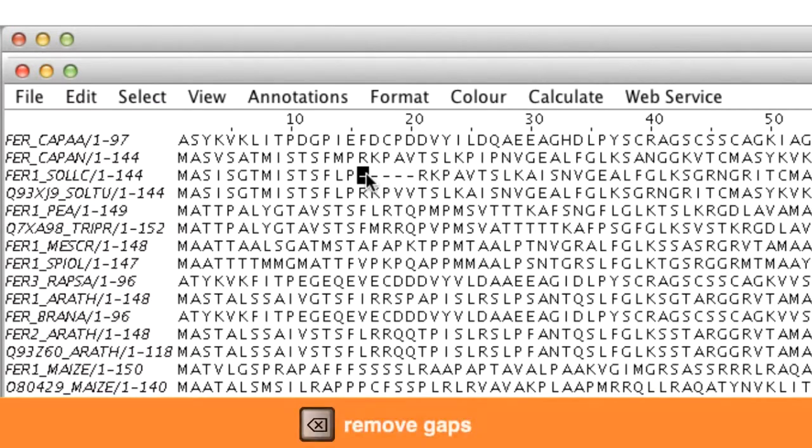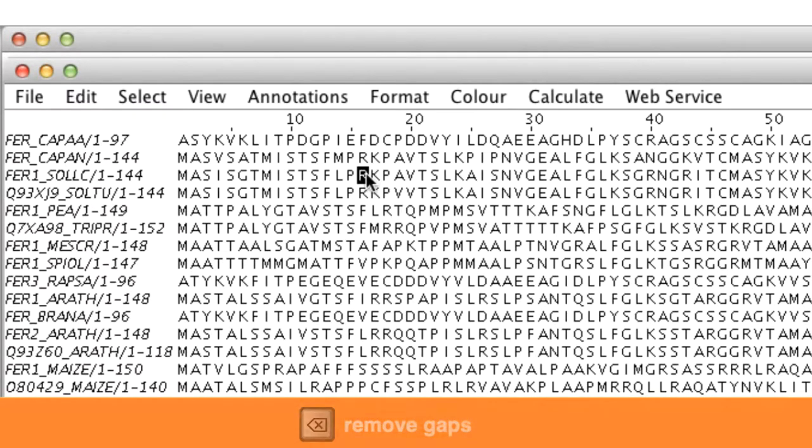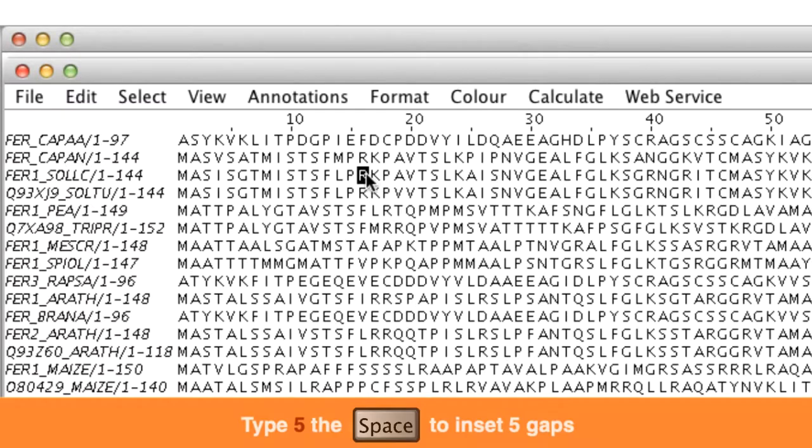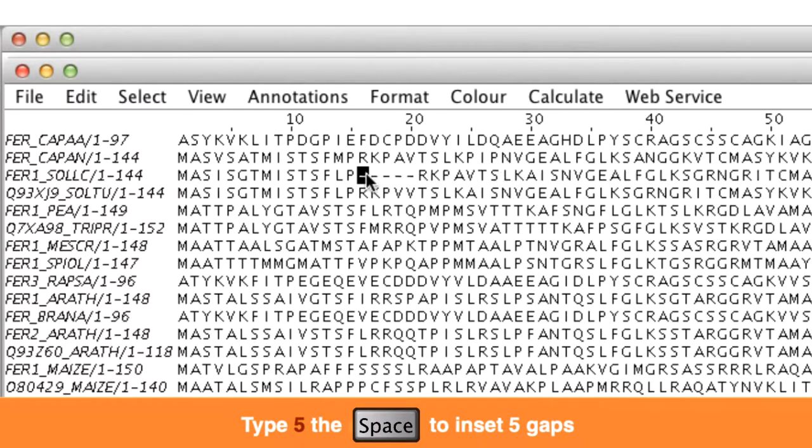Gaps can be removed in cursor mode by pressing backspace. Five gaps can be inserted by pressing 5 and then pressing space.